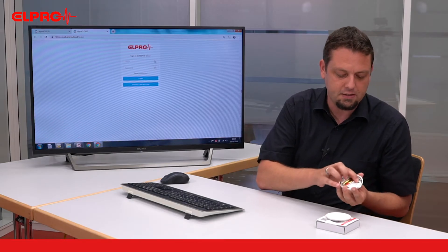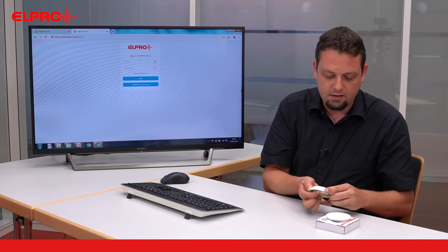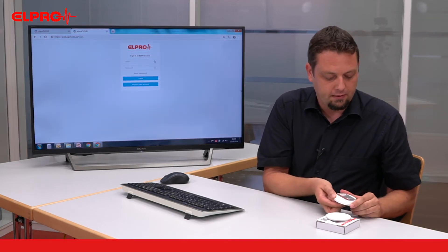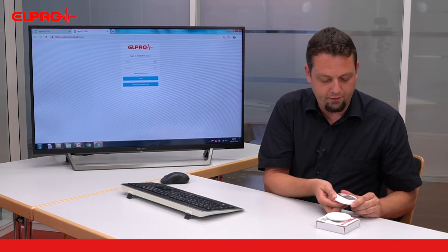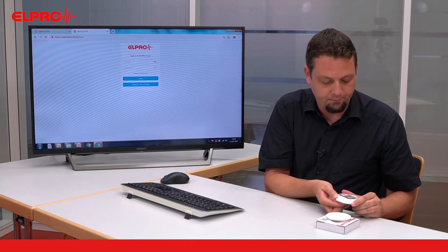All this needs to take place within the 10 minutes time frame that we have after adding the sensor in the software.